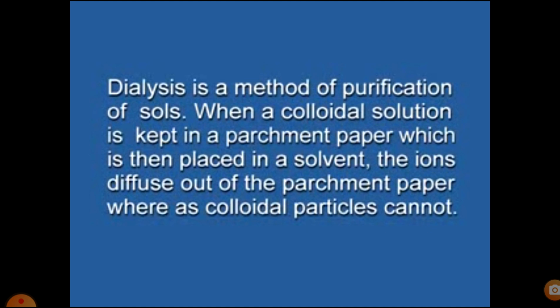For lyophobic sol of ferric hydroxide, dialysis is a method of purification of sols.